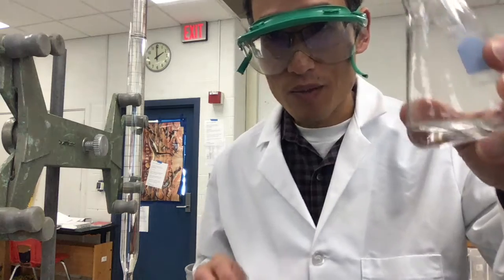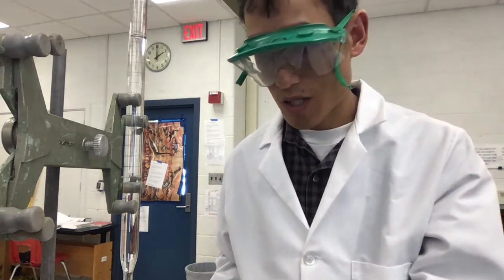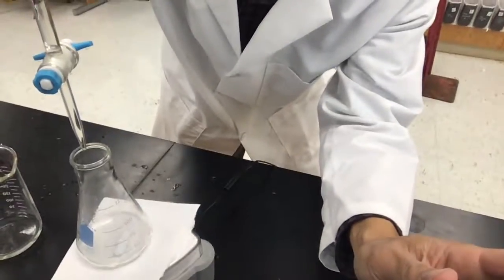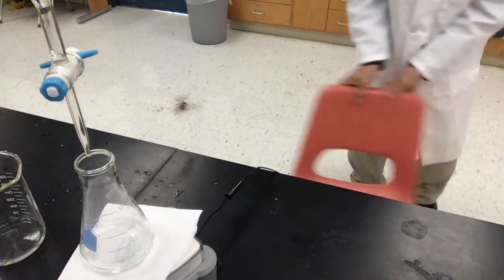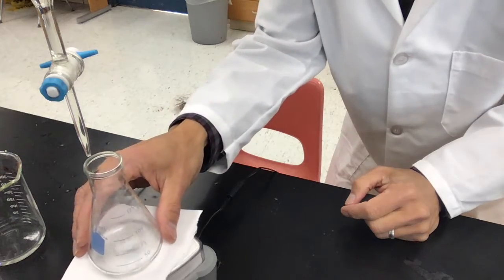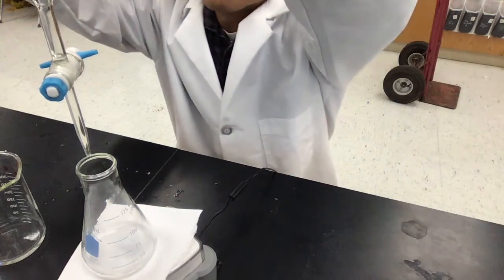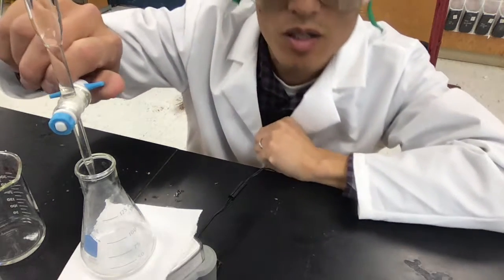So we're going to take our flask and put our stir bar in there carefully. I'm going to put some white paper underneath, okay? And then I'm going to turn on my stir bar. So the stir plate's stirring. I'll sit down here so you can see a little bit better. And I'm going to go ahead and start, I'll put this in here. Let's go ahead and start putting this in here.